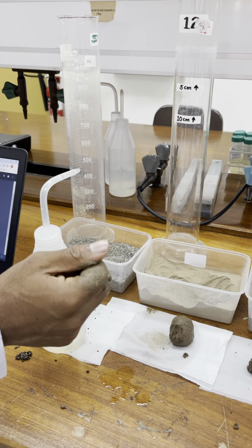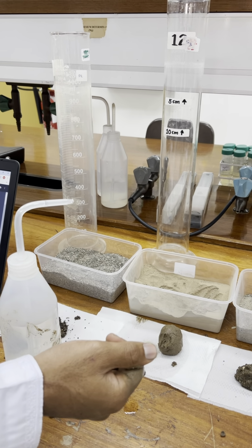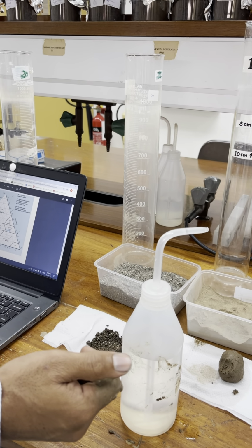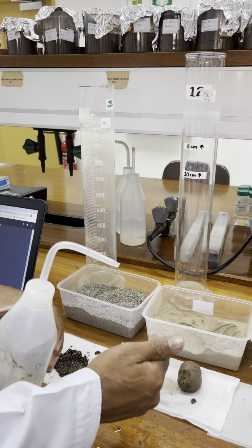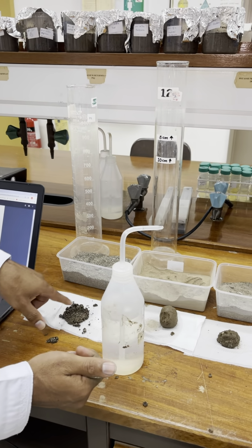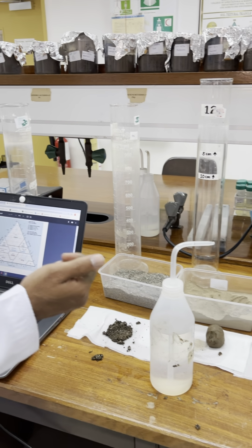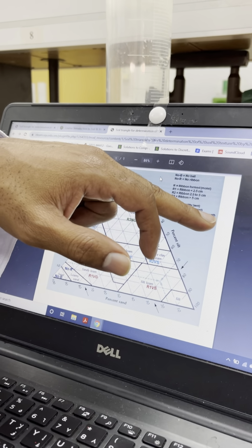What you do, you can calibrate your feeling. You can, for example, wash your hand again and try the feeling of sand. The feeling of a sand is very gritty. So if you know what is gritty, then you can know the other feelings. So to me, this feeling is in between. It's not gritty as the sand, as the first sample, and it's not very fine as the flour. Still something in between. So the code is NGS, neither gritty or smooth.